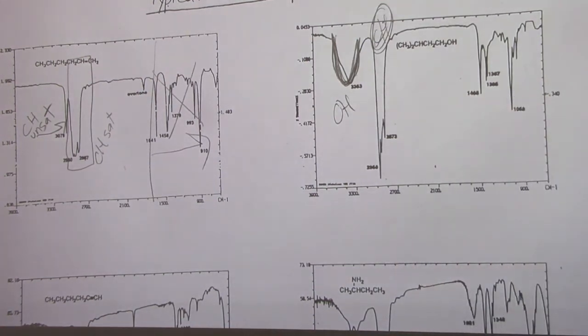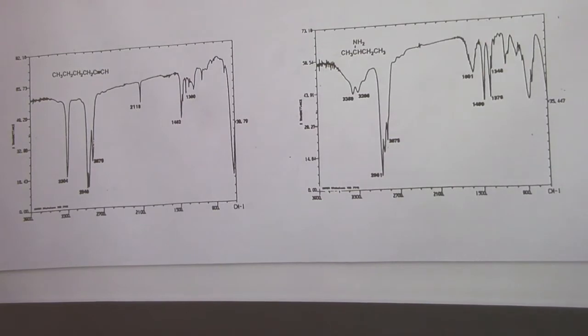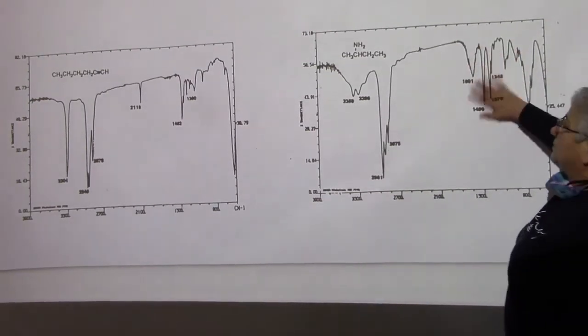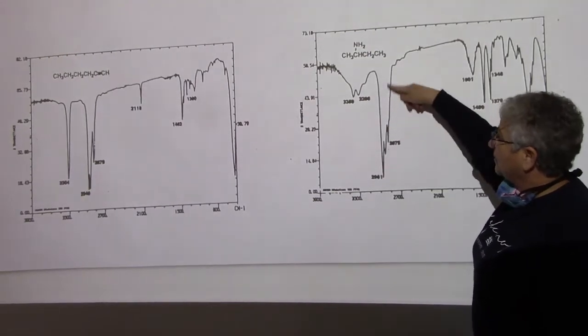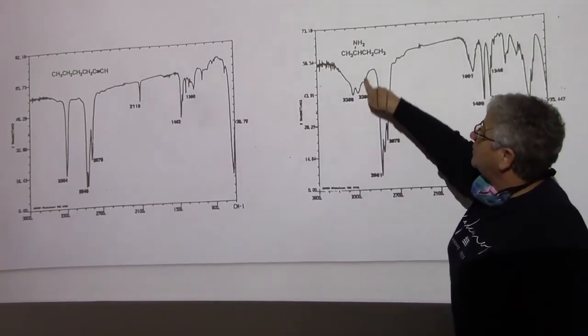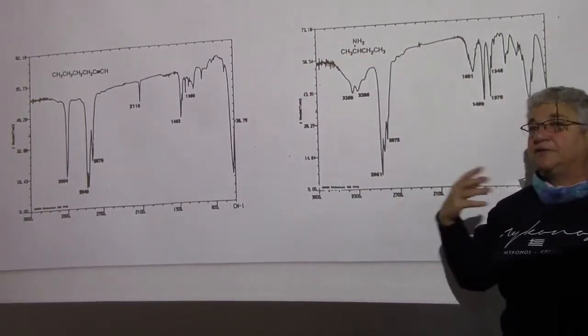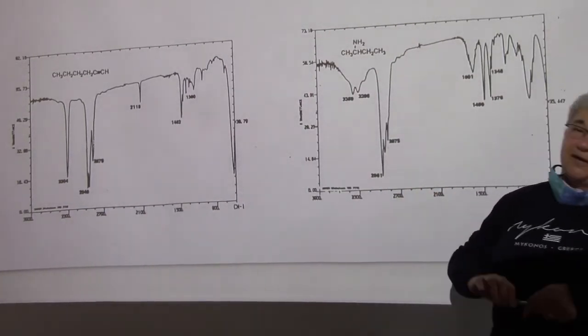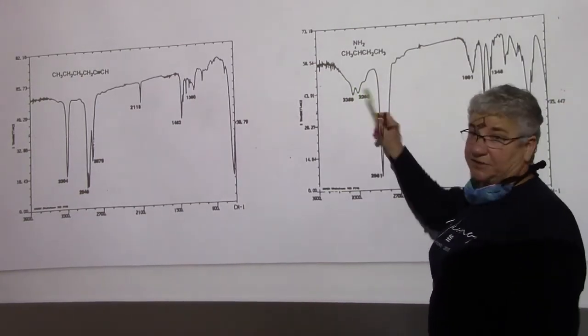But if you look at the spectrum right below it, again, fingerprint, don't care, no triple bonds, CH here. And then I look at this one and the one above it, and they look different to me. In particular, this one looks different because there are two little nubs here.